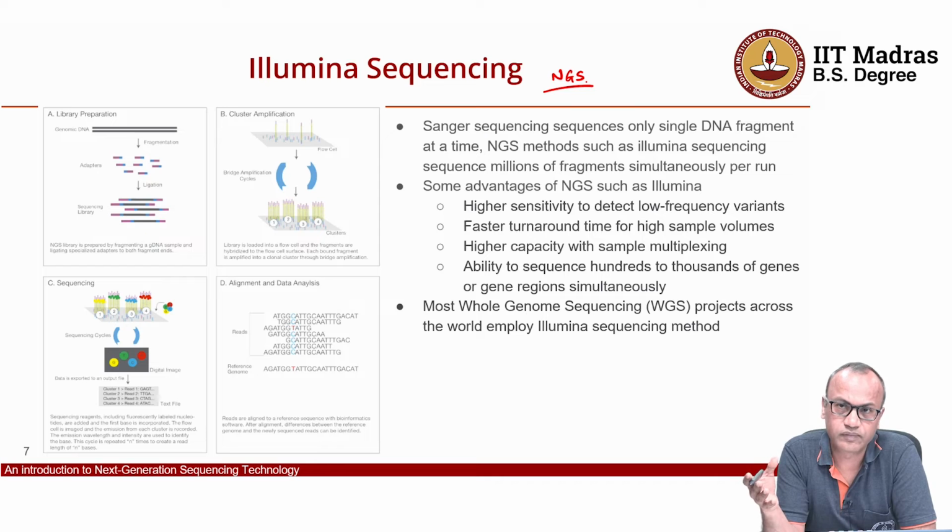Along with this next generation sequencing, which generates a large amount of data, because let's say if you have to sequence a human genome, you're at least sequencing 3 x 10^9 multiplied by 100 times the amount of sequence. It requires different kinds of computational approaches, and novel algorithms were developed because of the availability of a different kind of data that was not existing before.